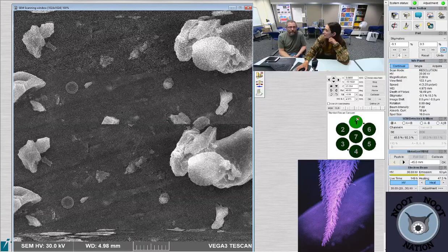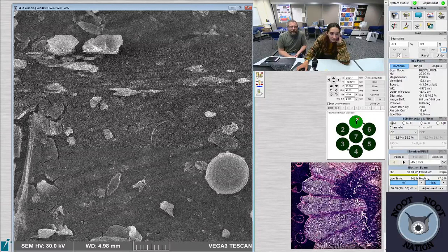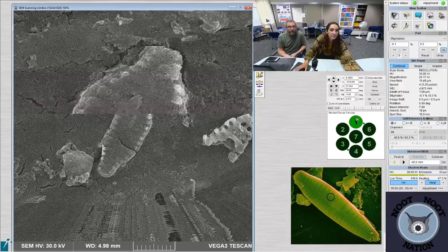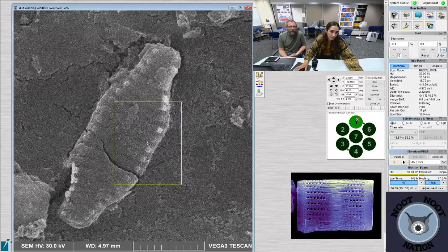And they collected diatoms from the water, or what they think was the water that the watering hole was there for. And so those are Miocene age. And then there's some samples in an adjacent place called Grove Lake, which is another formation where there's diatomites. And those are about 6 million years old. So the ones from Ashfall are about 10-ish million years old, and the ones from Grove Lake are about 6 million years old. So we'll be looking at some really old stuff.